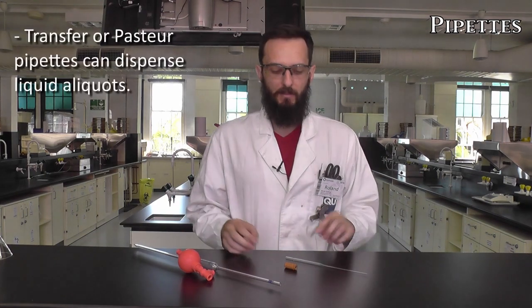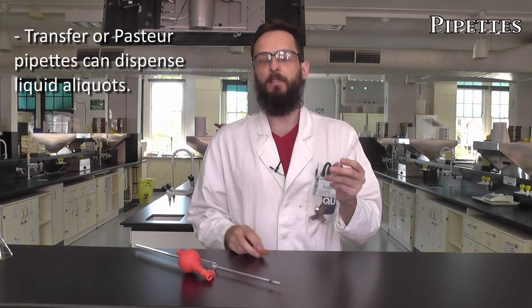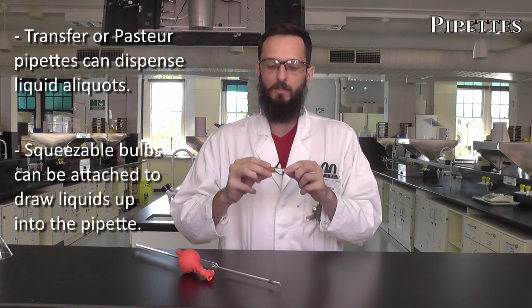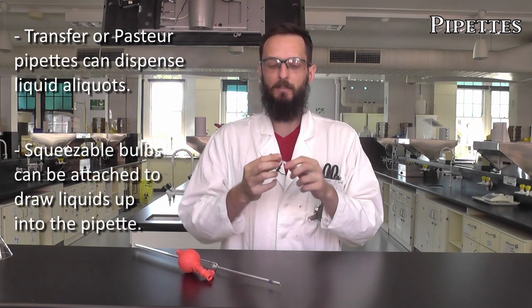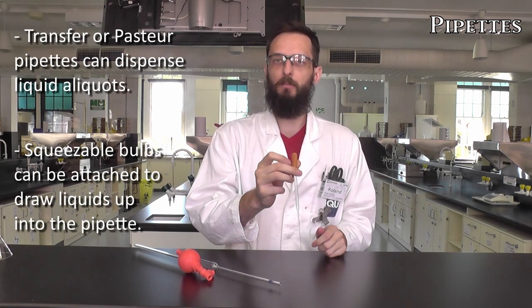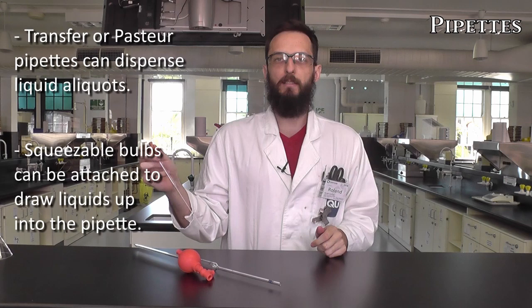When we want to transfer liquids from one place to another we can use pipettes. This is a transfer pipette, also known as a Pasteur pipette, and they're used in conjunction with these orange bulbs. All we need to do is gently twist the bulb onto the end, then we can squeeze the bulb, place it into our liquid, let go of the bulb, move it across, and squeeze again to dispense.